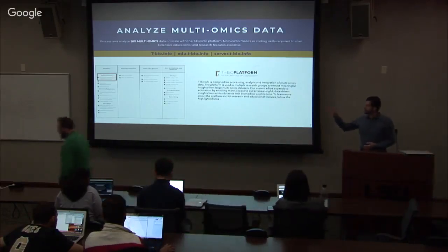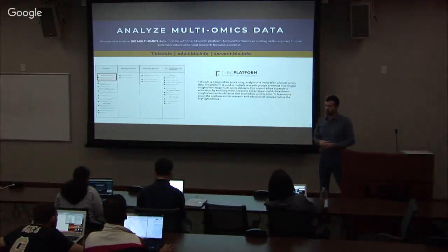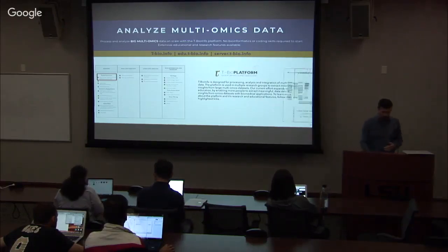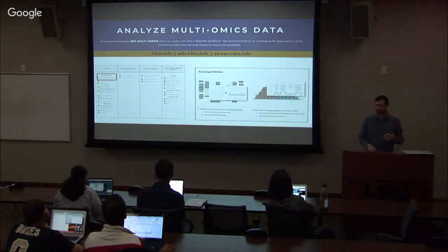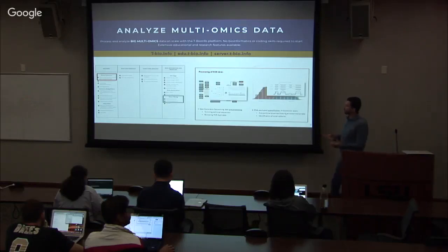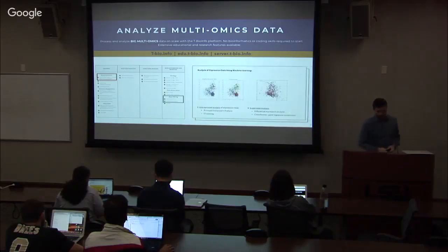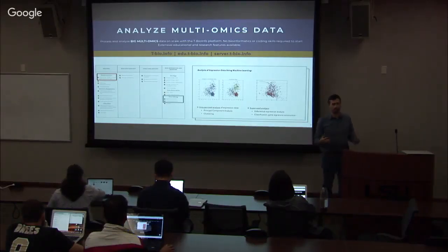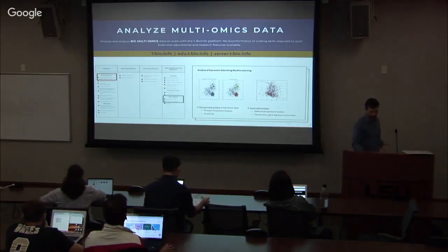The first section at the top is called Transcriptomics, RNA Seq. That's going to be one of the sections for processing the data. We will take a look at how to prepare the data from short reads to a table of expression and how to do differential gene expression. The second thing that we'll look at, if we have enough time, is a little bit of exploratory analysis. That includes some machine learning methods in the context of RNA Seq: how do we do things like PCA, explore our data, and visualize our data.